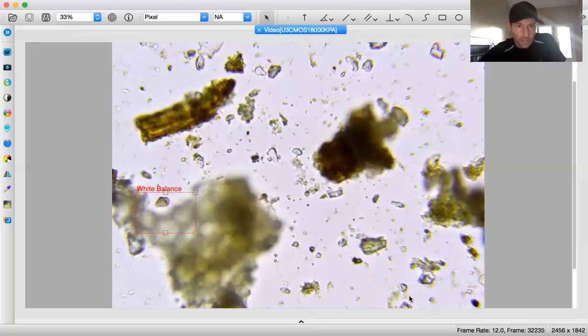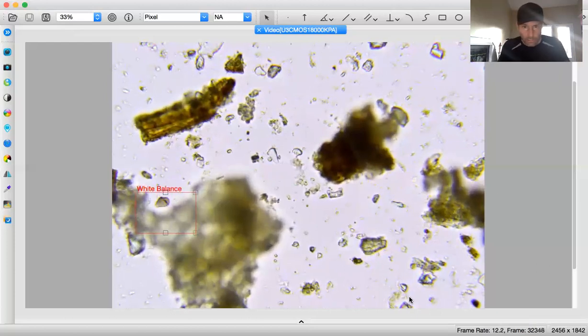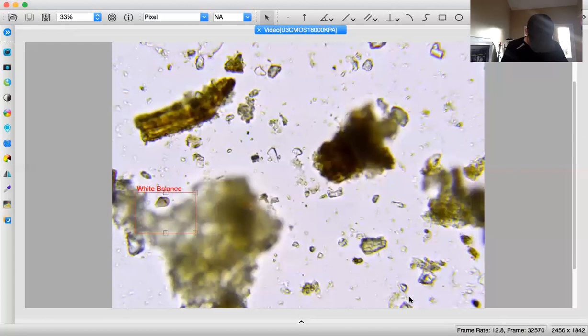I want to say actino, possibly. I'm going to go ahead and record it because it is a uniform filament organism, and we are supposed to measure those and count them as actino if they are less than 1 micrometer, 1.5 actually. So that would be a 0.075. And this is 3.075 actino.